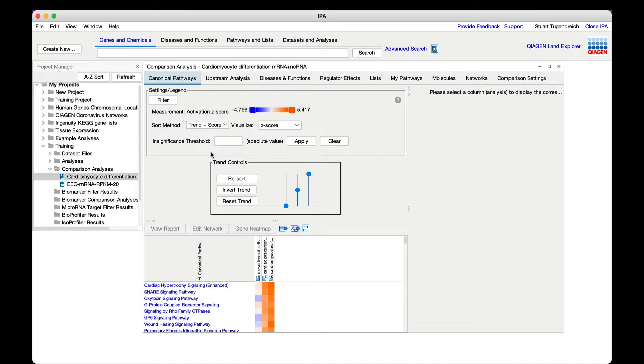But we can instead look globally at all the biological predictions that trend with time across the differentiation program. This is accomplished using a comparison analysis, which uses a heat map to visualize IPA's prediction across up to 20 analyses.